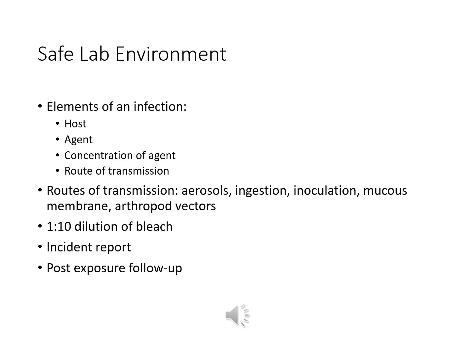Typically, we will still make up a 1 to 10 dilution of regular household bleach. You're basically going to wipe down your counters before and after you work. If you have a spill or you know that the protocol has been broken, then an incident report needs to be followed up and completed, making sure you're following your facility's guidelines.